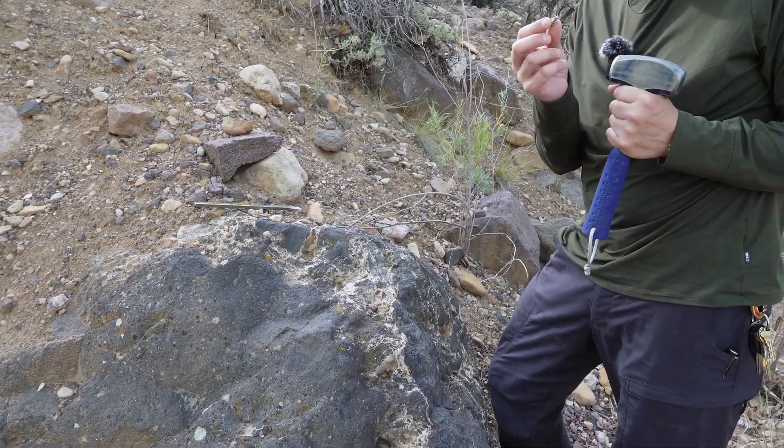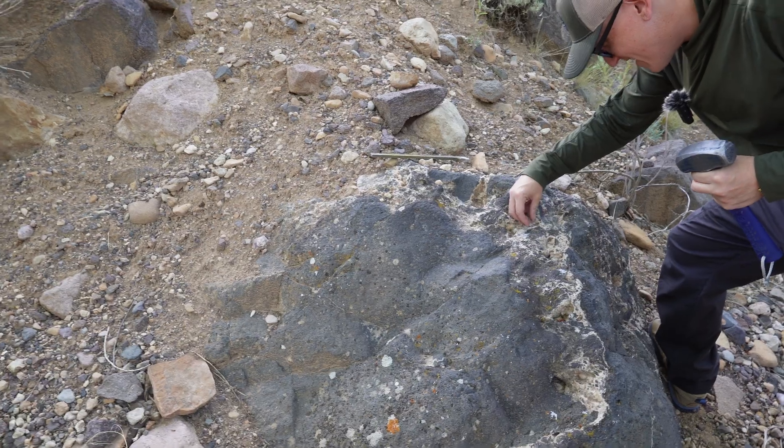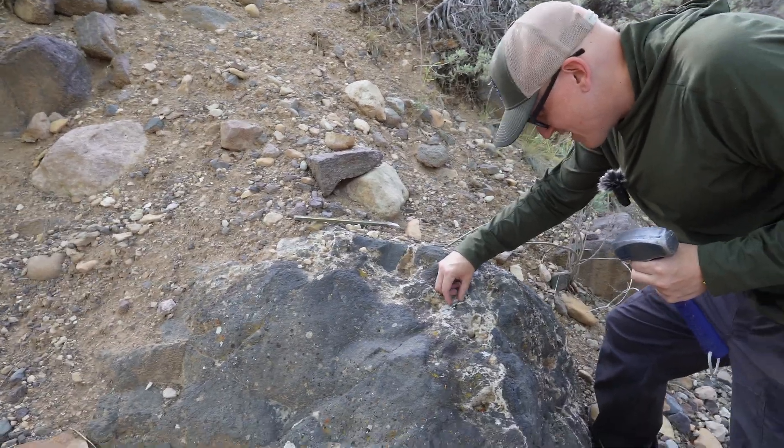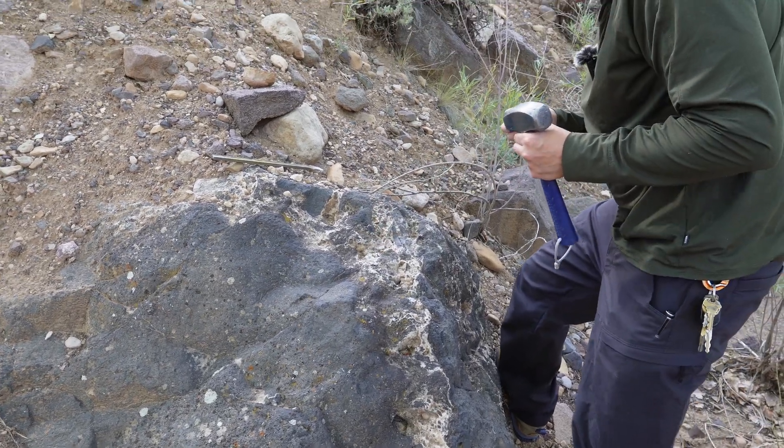Little tiny crystals, Sarah. It's really smooth on the outside — like it's really weathered. Yeah, looks good that you can break some off.